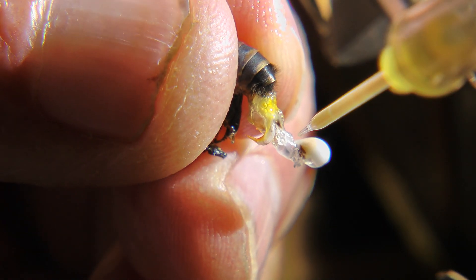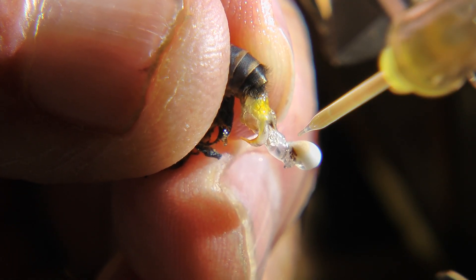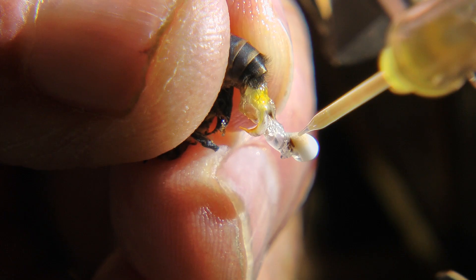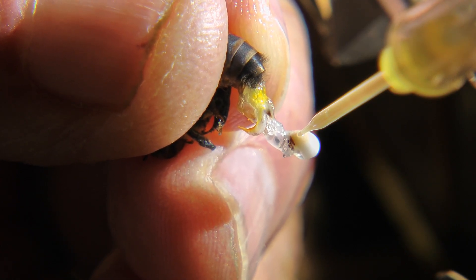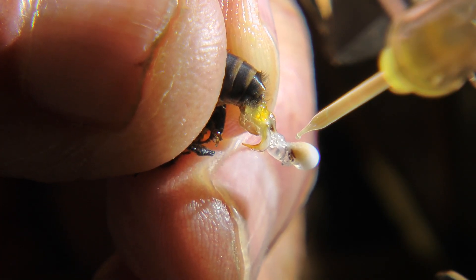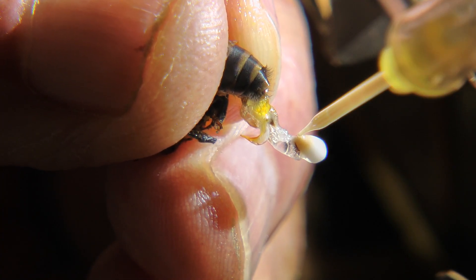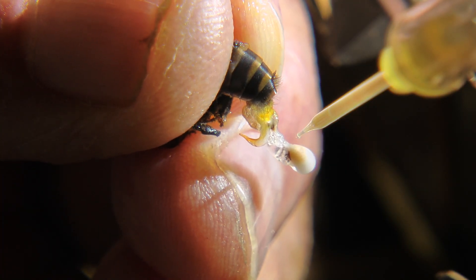He sucks the semen up in the syringe and tries to avoid getting any mucus — not much here, but some.